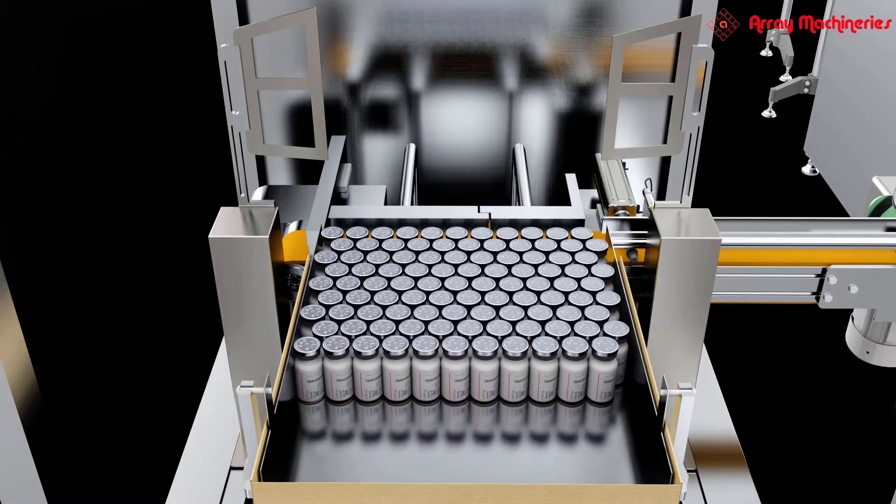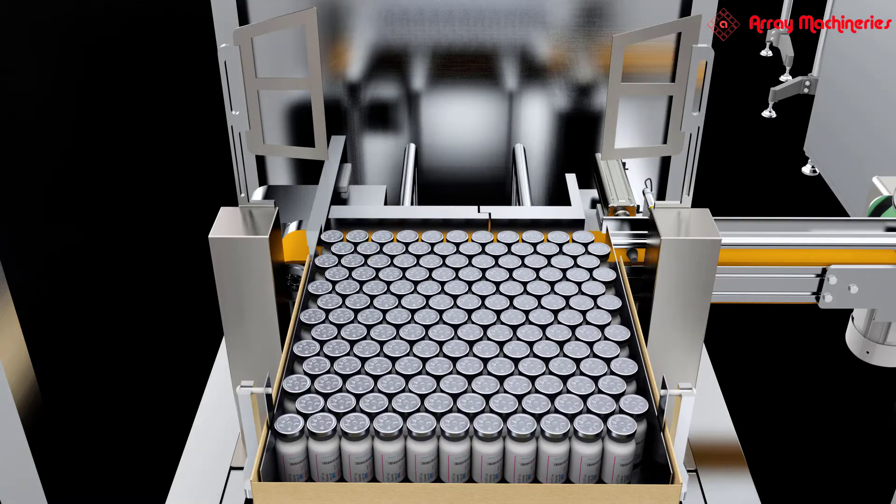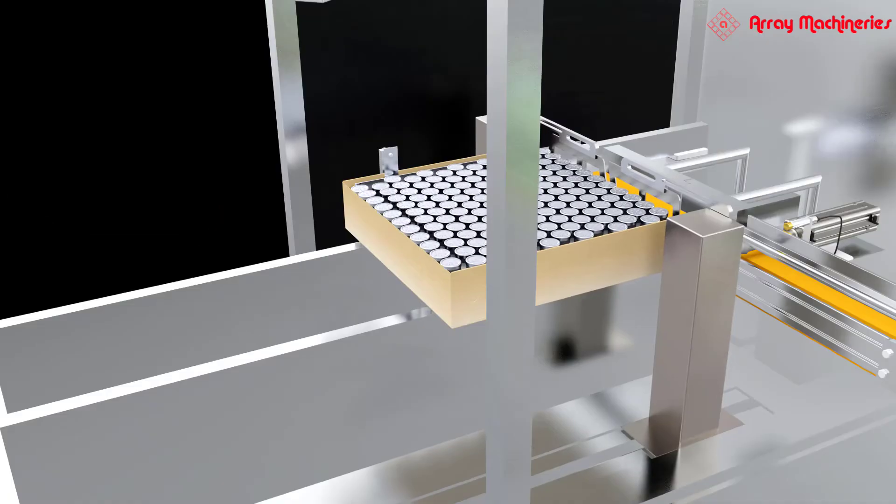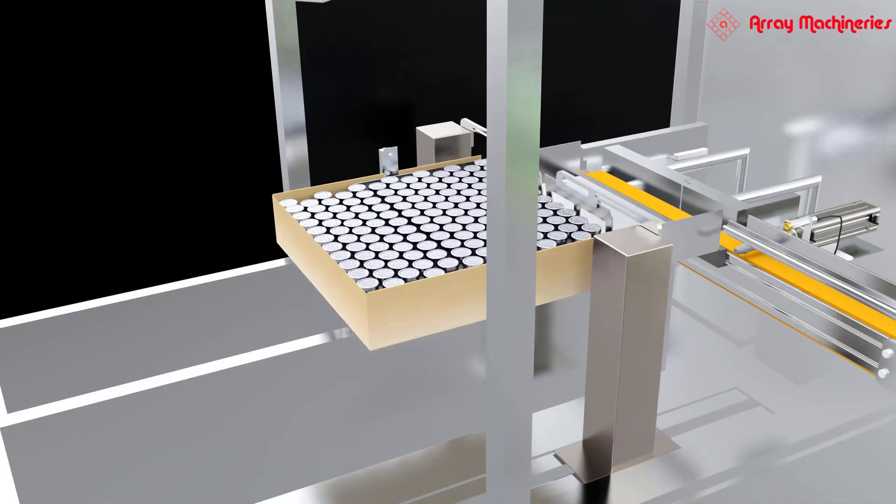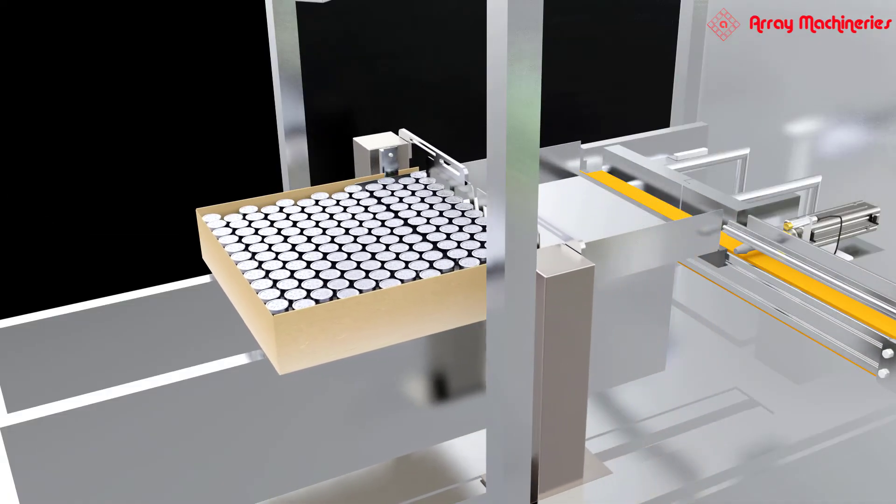A horizontal stopper board at the end of the servo conveyor ensures the arrangement of vial rows in diagonal form to each other. The process continues till specified tray limits.